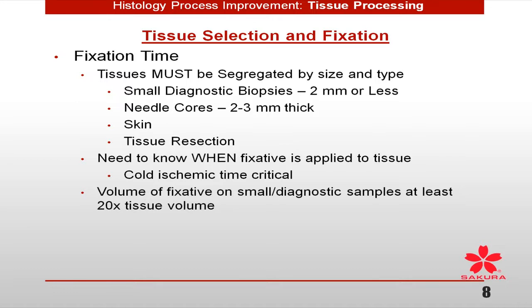My first question when I saw that was, if it's critical on a breast biopsy, why isn't it critical on a different needle core biopsy? Why isn't it critical for a cervical biopsy, or for a gallbladder that comes out? I think it is.